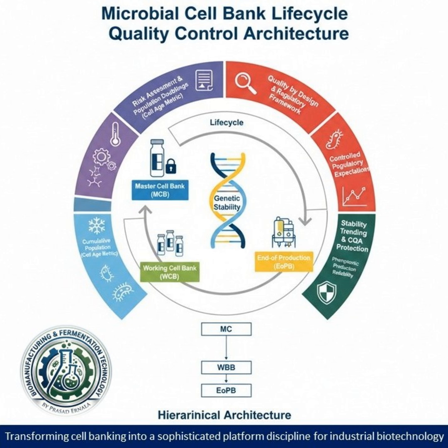Digitally and rigorously, yes. You need that history because you have to model your validated CPD limit and prove it's never exceeded. That model even has to account for worst-case scenarios, like using multiple WCB vials or having a delay in the seed train. Regulators want to see that limit locked down.